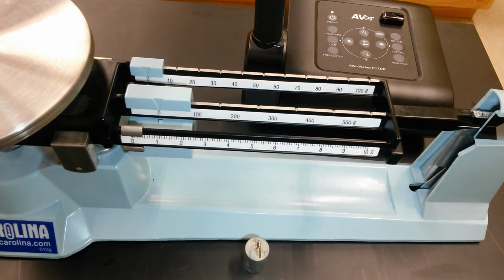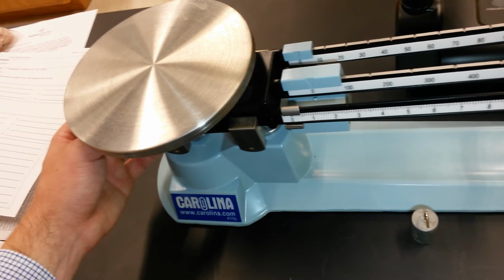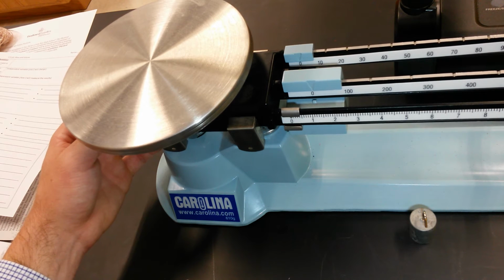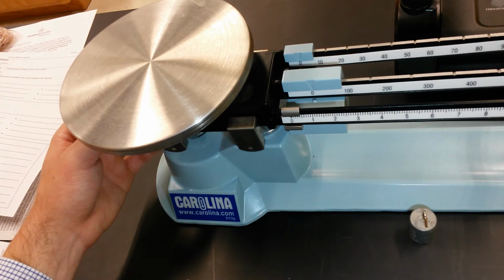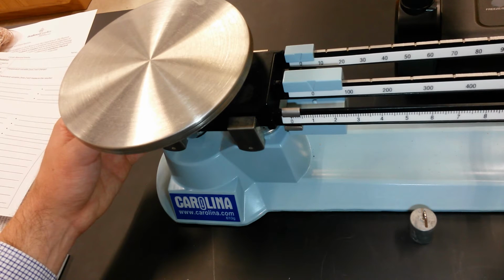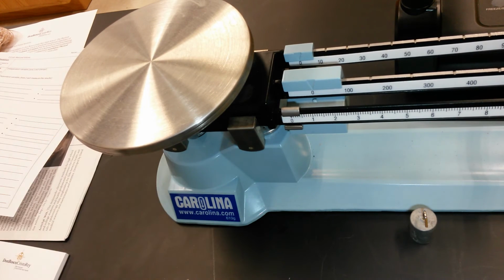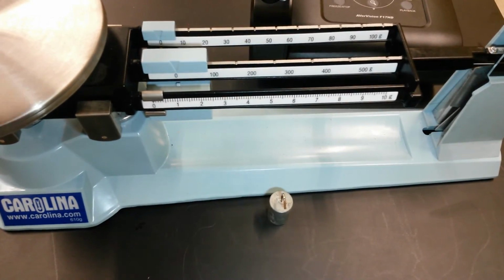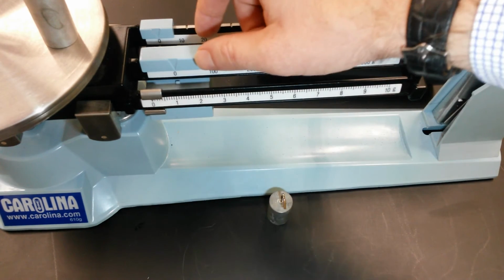If it's not, then I can go onto this left side and I can adjust it by moving the little balance over here one way or the other. Okay, so since it's a little bit below the 0, I can turn it to adjust it a little bit further out, and that makes sure that it's calibrated. Okay, so now if I want to find the mass using a triple beam balance, I place my object on the balance, which as you can see tilts it, and I'm going to start with the biggest set first.